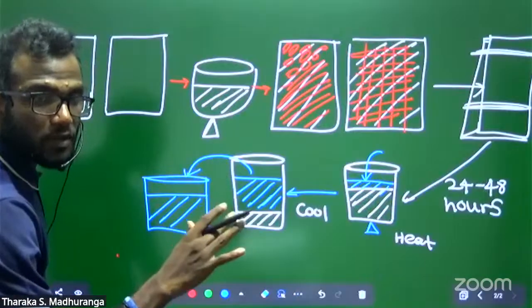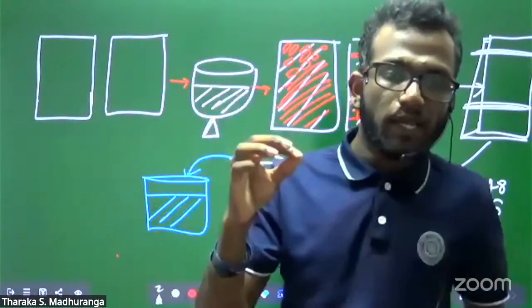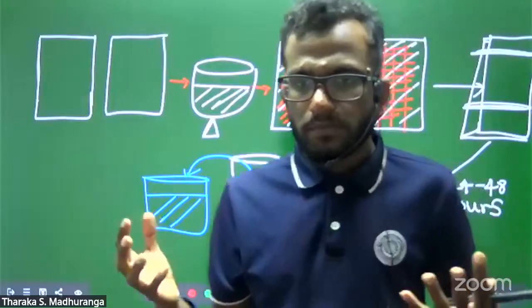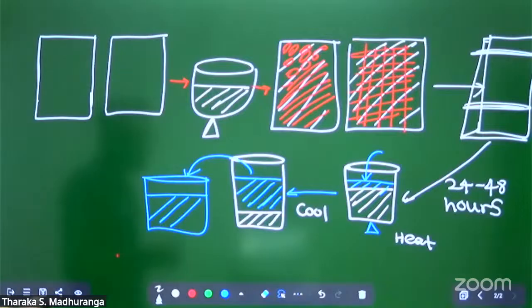We need to be careful while heating, because the compound is volatile. You can't heat at any temperature as you wish.